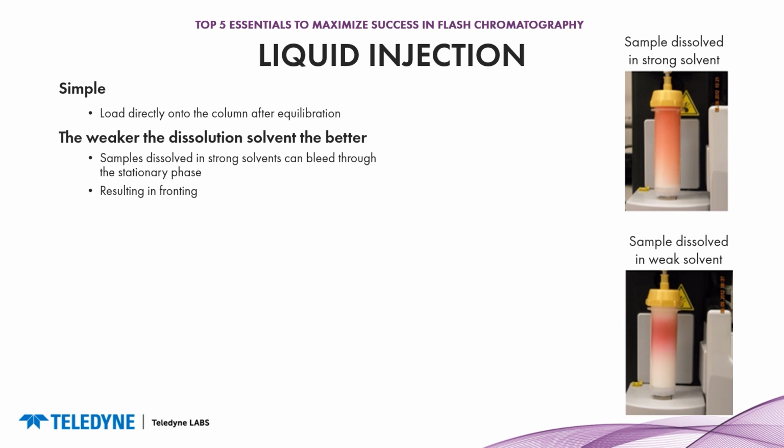But if we dissolve our sample in a weak solvent, like the picture in the bottom right, you can see how much more concentrated that band of your sample is, and that's going to lead us to better chromatography.